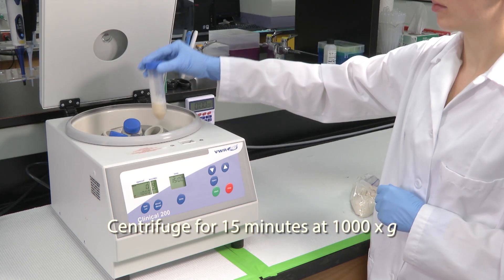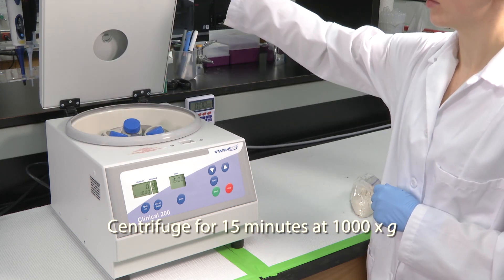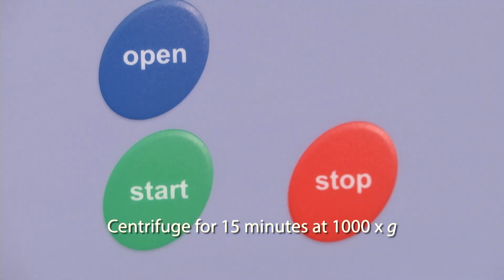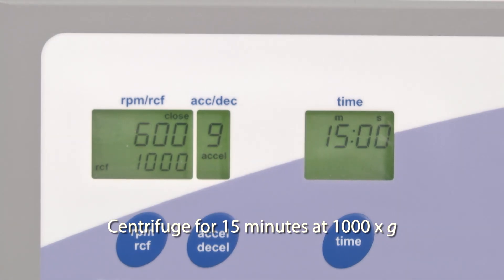Next, centrifuge for 15 minutes at 1000 times G. The extra tubes within the centrifuge are placed there for balance.